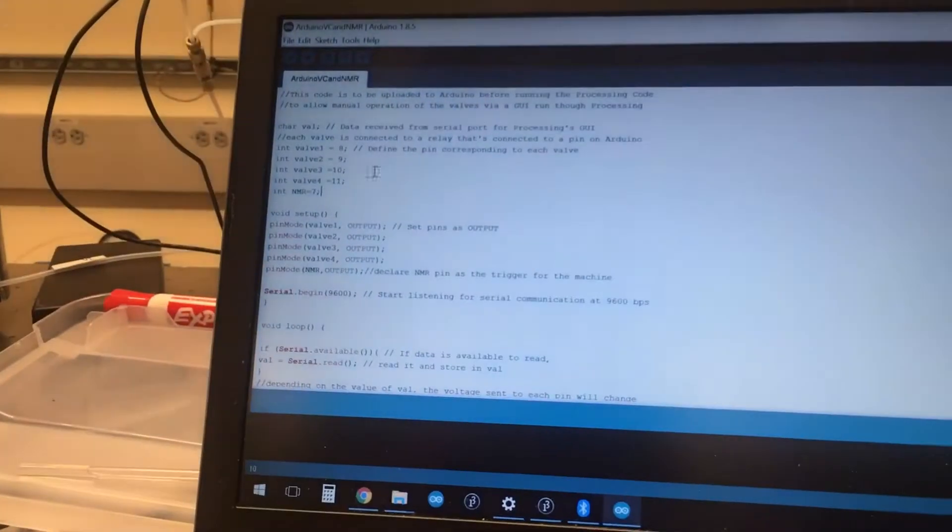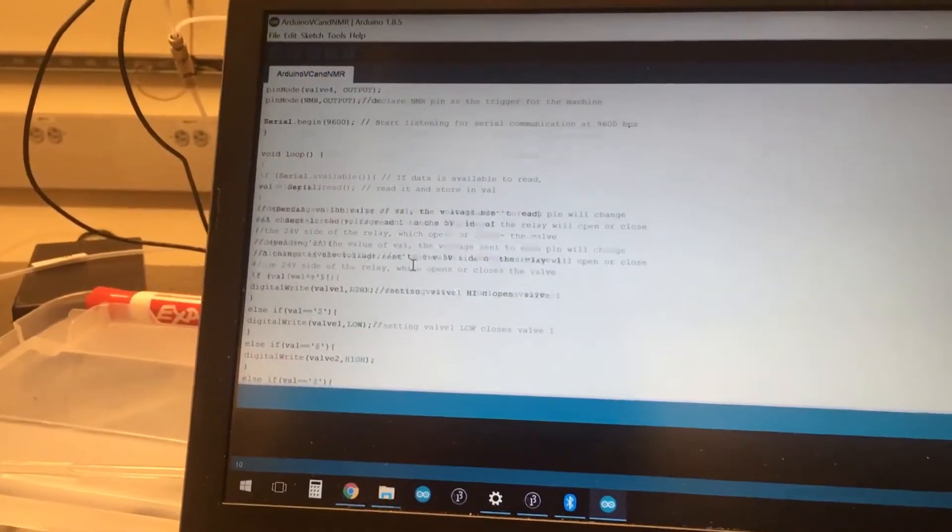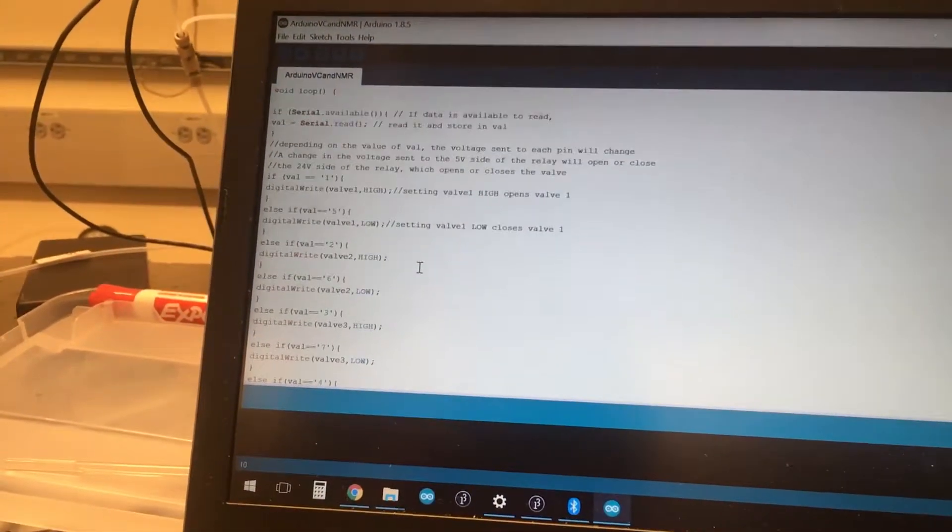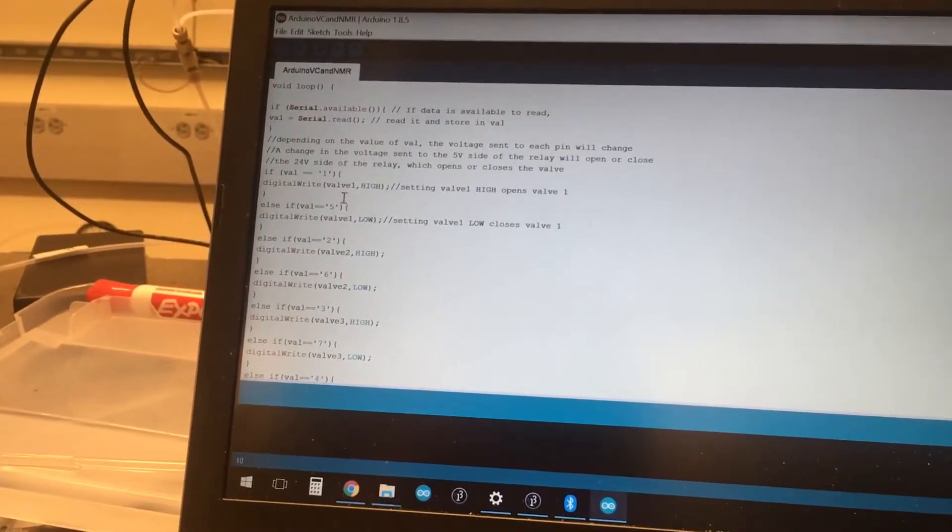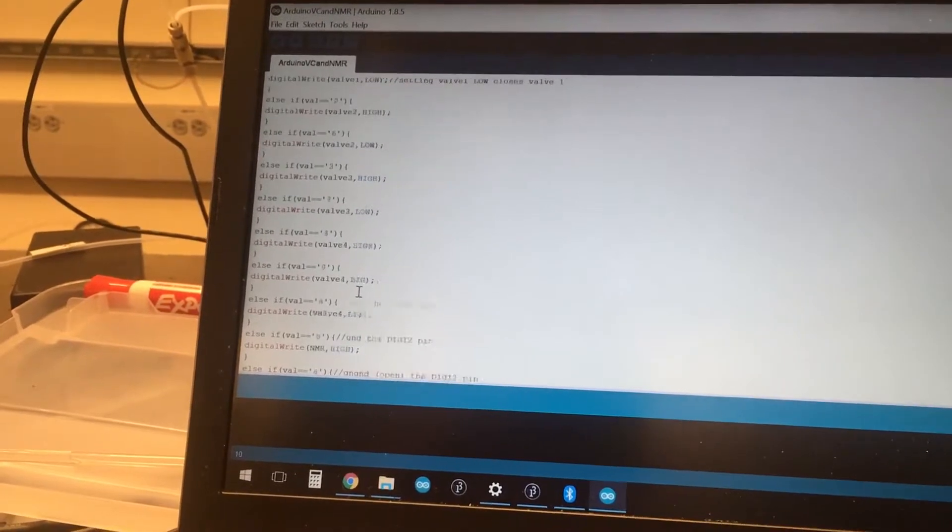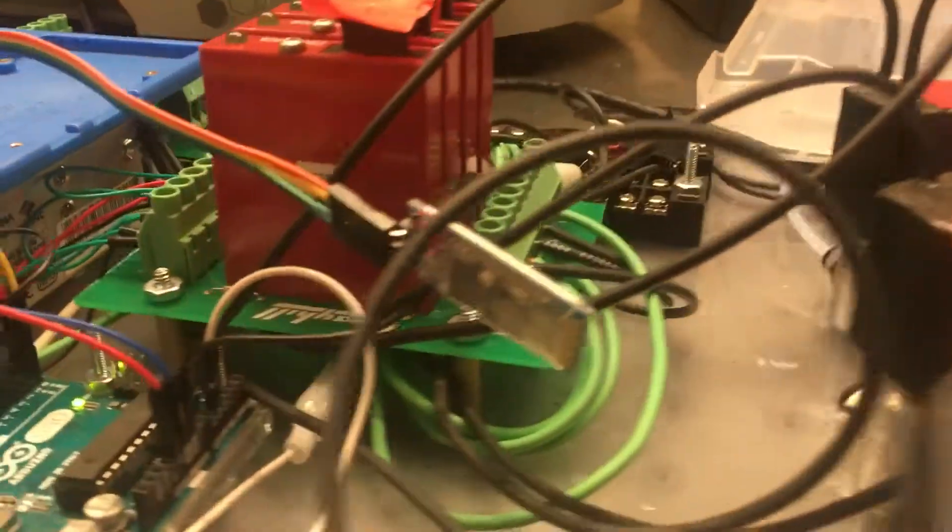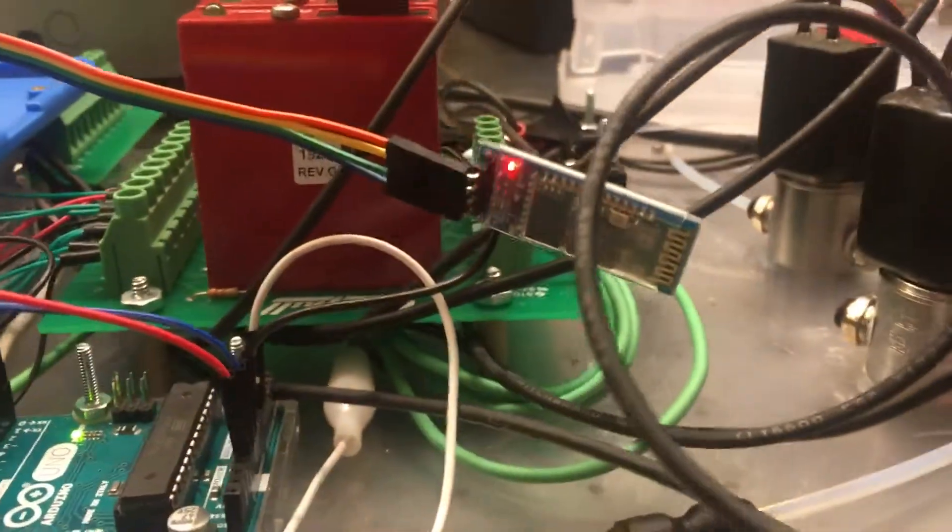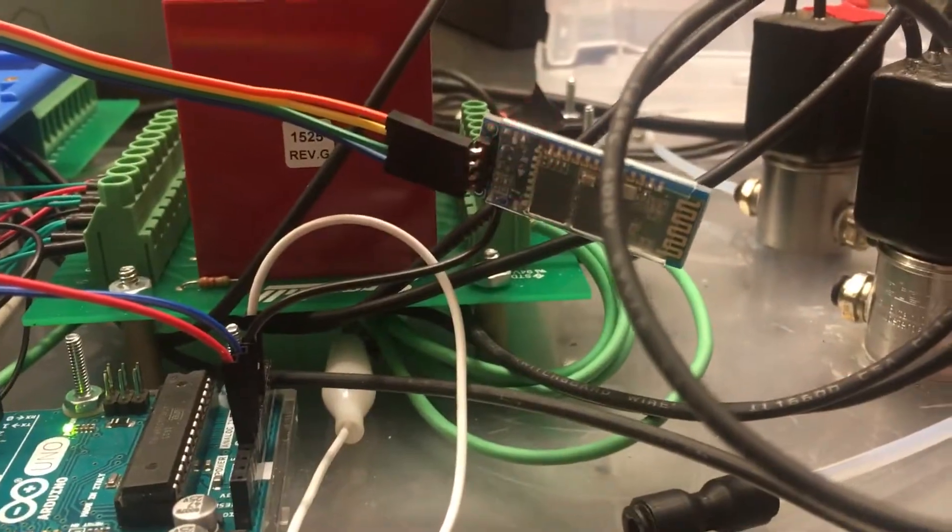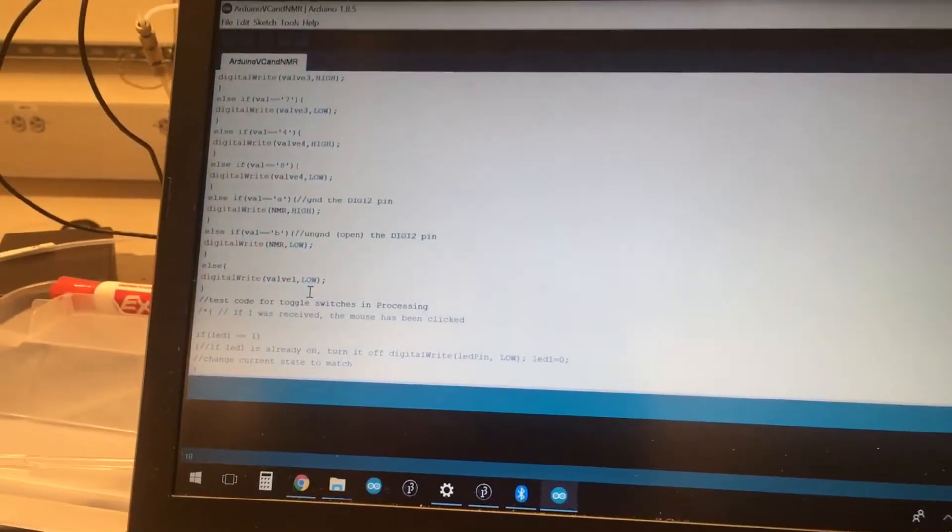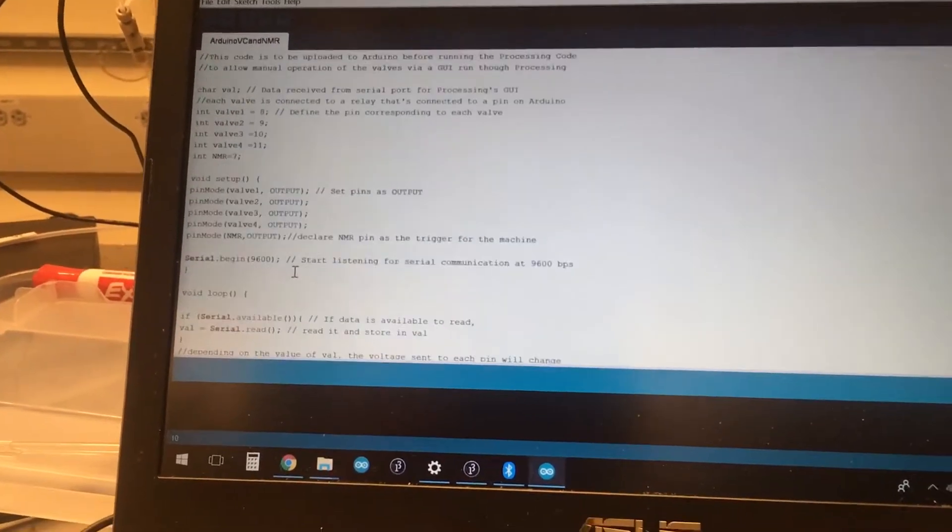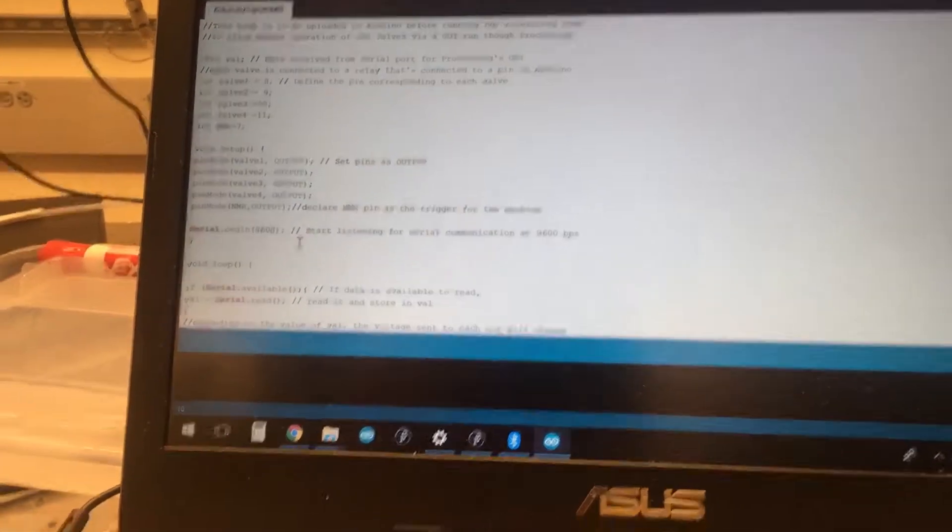The code is pretty straightforward. It just detects whatever value is read over the serial port, which in this case will be whatever is received by this Bluetooth module, and based on what's received over that wireless interface, it will respond appropriately.